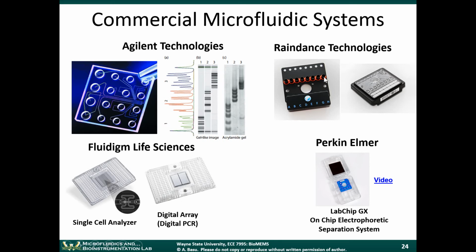Biorad was Raindance Technologies' competitor. They also do digital PCR. It's a very exciting and growing area right now. Fluidigm Life Sciences was, as I mentioned, Stephen Quake's company. They sold these PDMS devices that had a lot of valves and pumps on chip, and a lot of individual chambers for doing single-cell analysis, here on the left. And then they also do digital PCR, although their digital PCR products have been superseded in some ways by Raindance's technologies and also Biorad's.